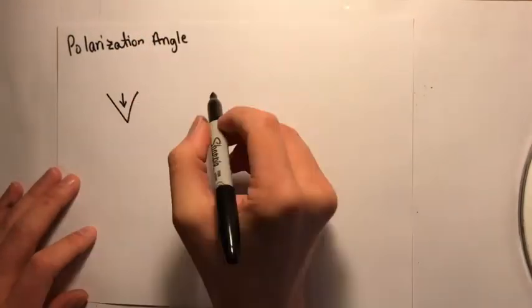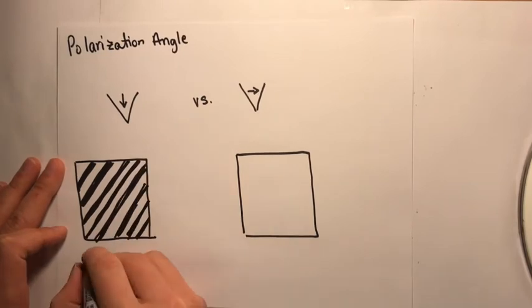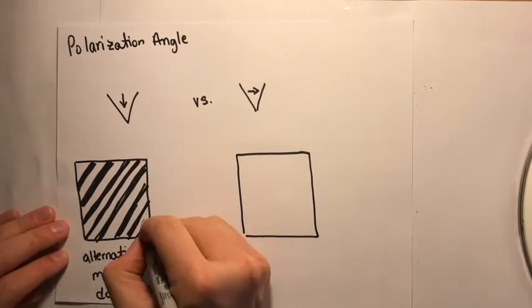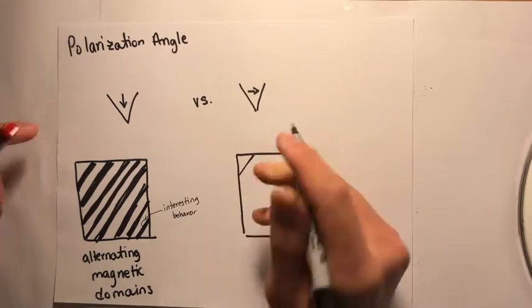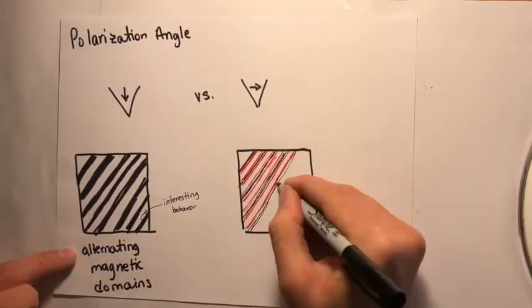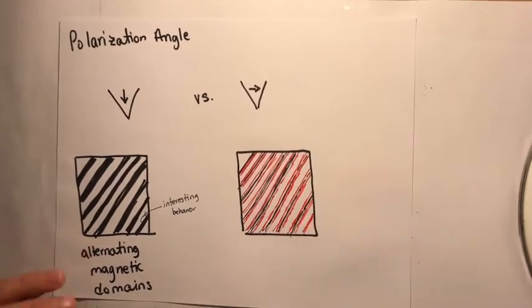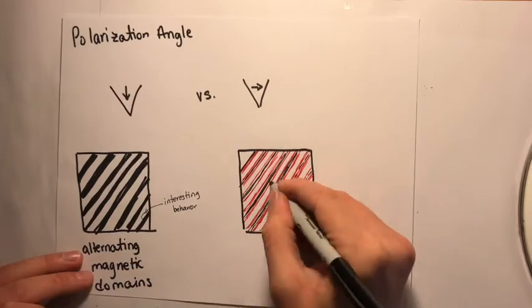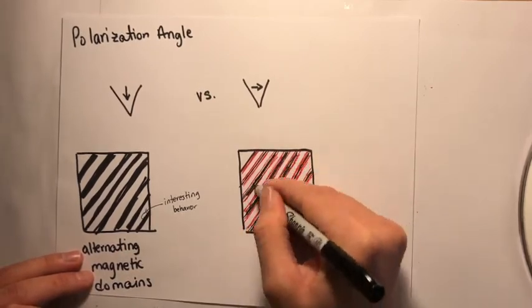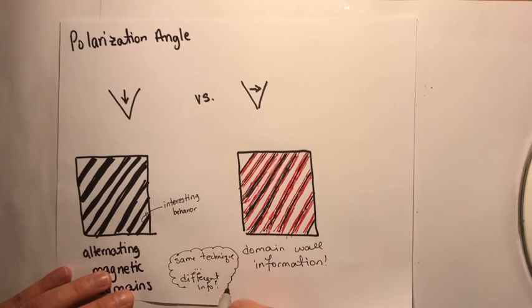Finally, polarization angle is very important. If you choose an out-of-plane polarization, you might be able to image your magnetic domains themselves. However, if you choose an in-plane polarization, there's really interesting behavior at the sidewalls of these domains that you can image, and you can understand what the walls of these magnetic domains look like. So you'll get entirely different information, both completely valid, just by choosing a different tip. This makes SP-STM a very powerful technique, particularly in magnetic systems.